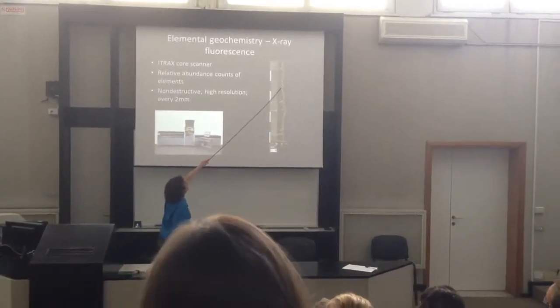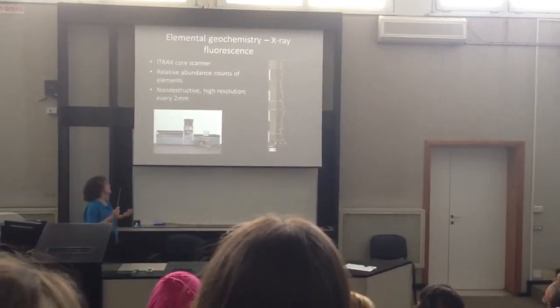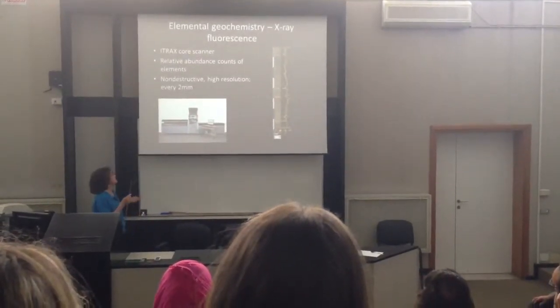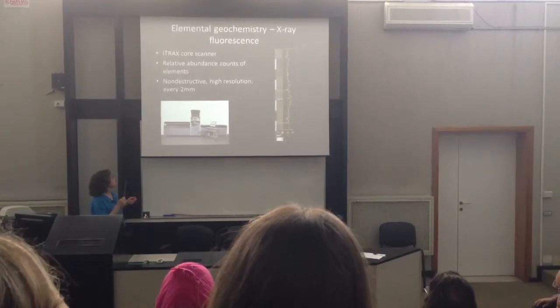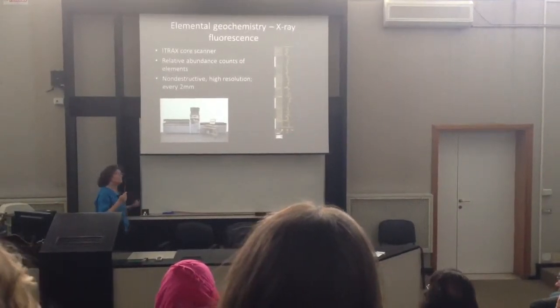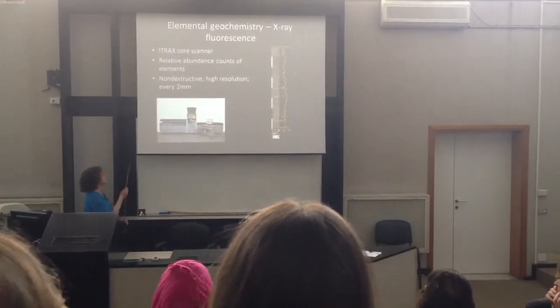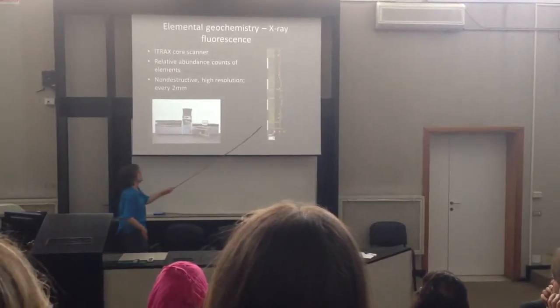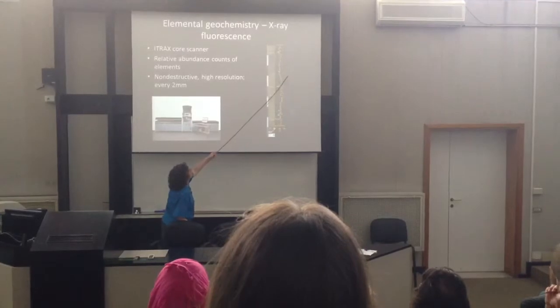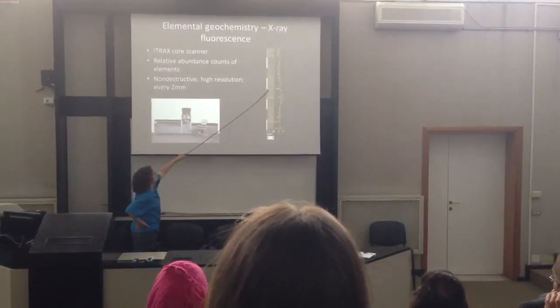Titanium is an element that is commonly associated with sand, silt and clay-sized grains. These are the typical types of minerals that we find in soils and transported in rivers. So it's giving us one kind of signal, and then the calcium is associated most likely with the mineral calcite, which is present in some of these lighter layers here.